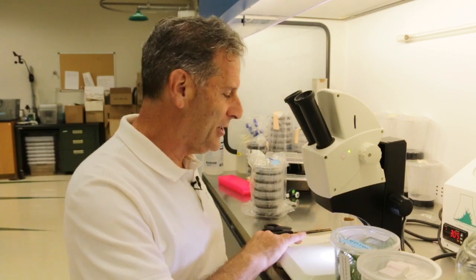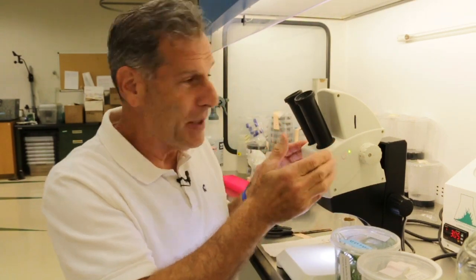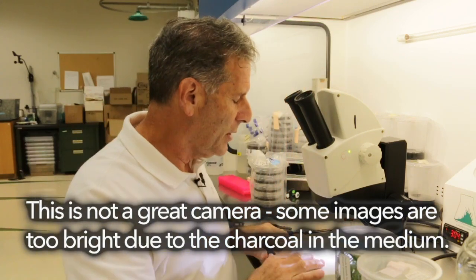Earlier today I went into the laboratory and I'm comparing a medium called P723, which is a standard seed germination medium, to a version I've generated in my laboratory — a variation on a soybean medium I developed many years ago, with some additional changes. I went and got the seedling plates and put them under this microscope that lets me take pictures, so I took pictures of this.